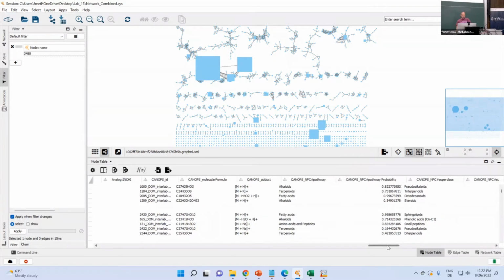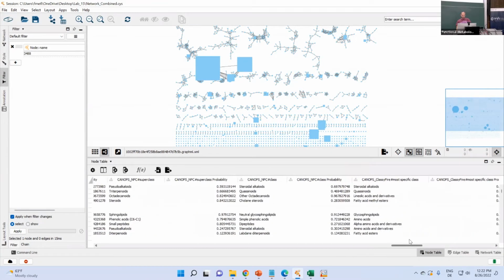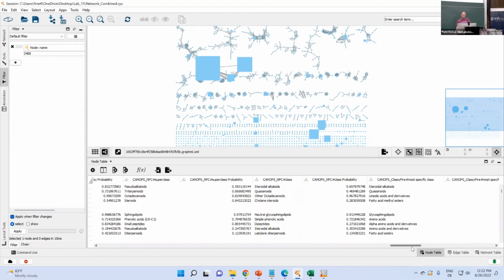So I don't know if there were any in silico hits in terms of structure. Oh, I did not import that yet. But yeah, a lot of class level annotations. Again, if you describe it, make it clear this is level 3. So we're far away from an ID'd compound here, but we may get some insights.